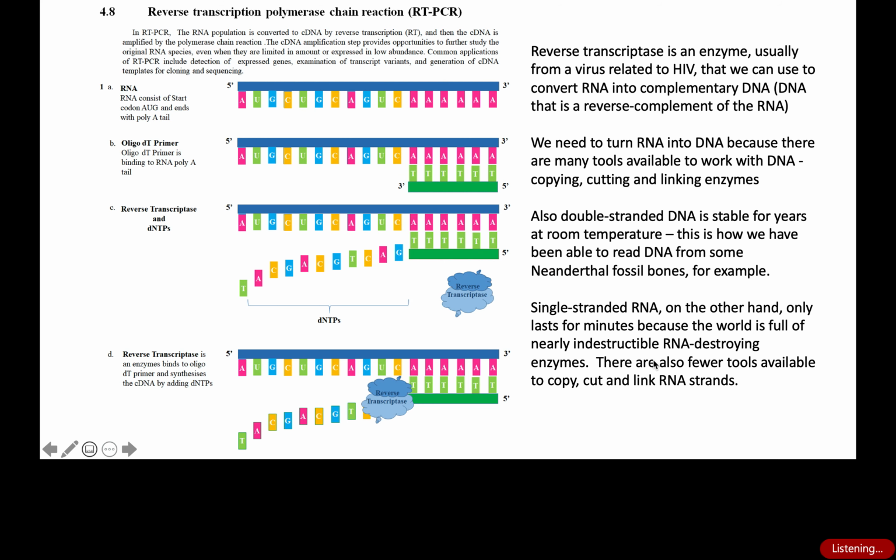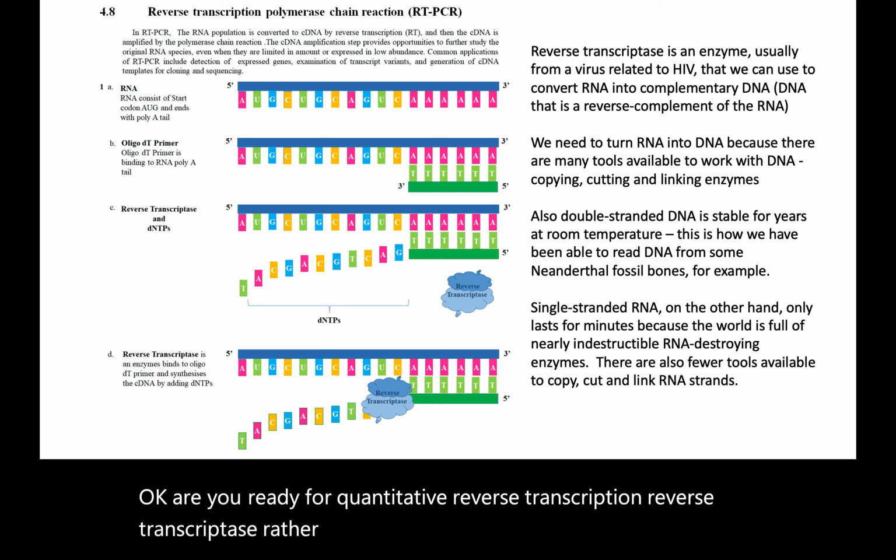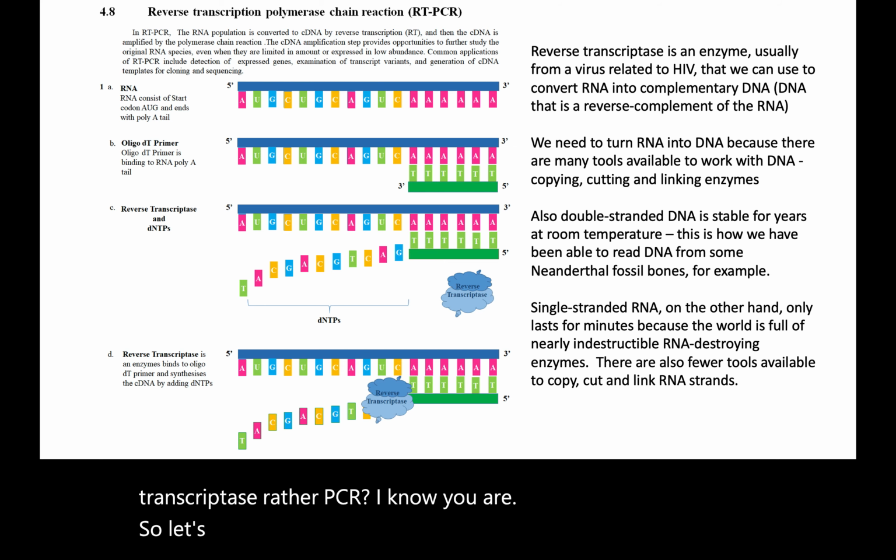Okay, are you ready for quantitative reverse transcriptase, rather, PCR? I know you are. So let's go. Let's talk about this and how it works.